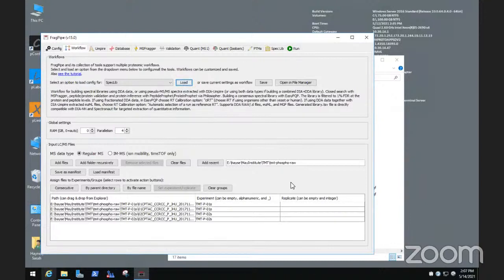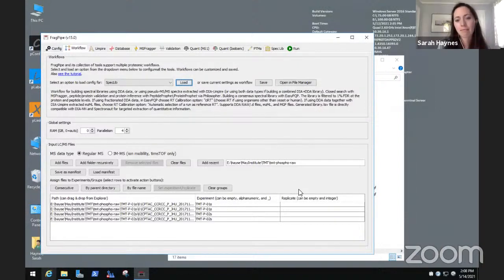There is the MSFragger-DIA workflow. I don't want to go into that workflow right now, but there is an alternative workflow to DIA-Umpire with direct DIA that's already available. If you're into DIA analysis, you can contact us. We can explain that, or we'll explain it better in the near future in a manuscript and in a tutorial.